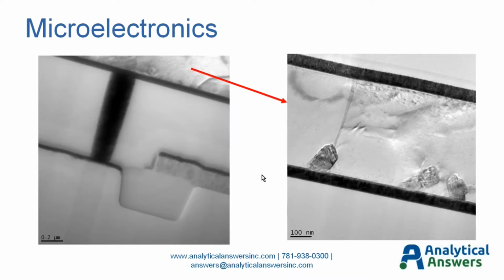So I'd like to step through a few examples. Again, now this is from the microelectronics. This is that same image I showed you earlier, and what we're going to do is look at higher magnification at the various features that are within this sample. Starting with the metal level, if we mag up on the metallization, we see the aluminum metallization. We're getting some diffraction contrast that highlights the presence of some smaller crystallites, as well as a larger, almost vertical grain boundary between two large crystals.